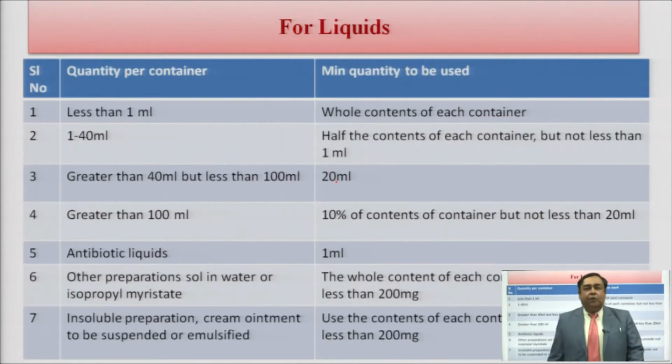Now, as I have told you, it is a process which has been recommended by the Indian Pharmacopoeia, and all the pharmaceutical industries across the country have to follow it stringently as a guideline, because depending on your test, depending on your report, the product will go into the market.